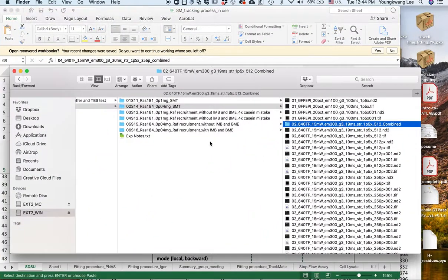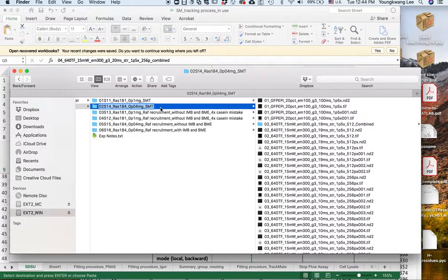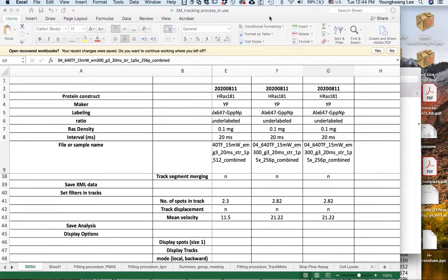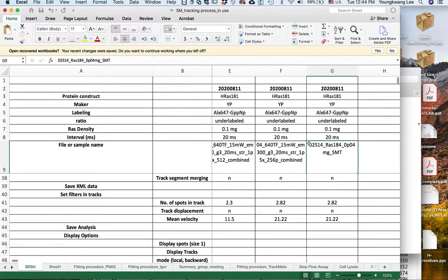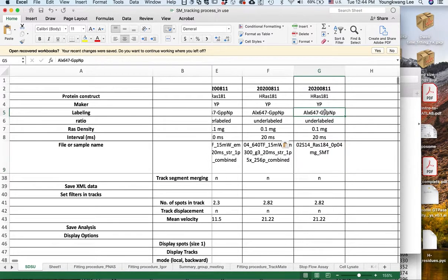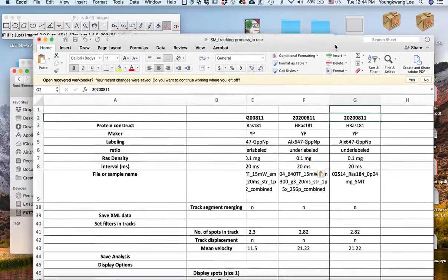So here I analyzed this set of data, right? So you need to enter this data, right? Okay, so let me correct this one.